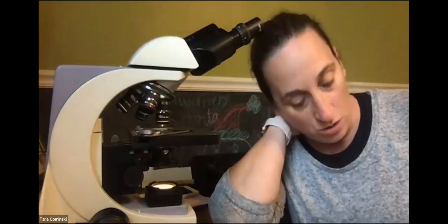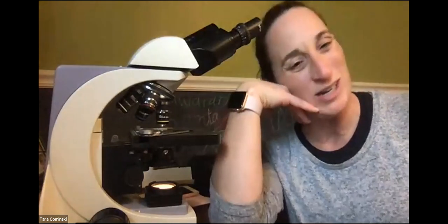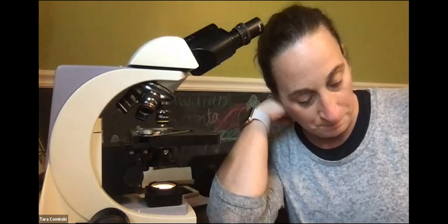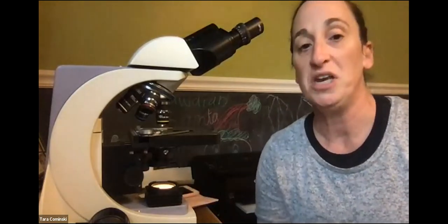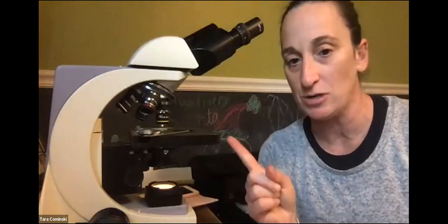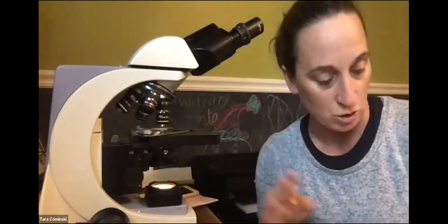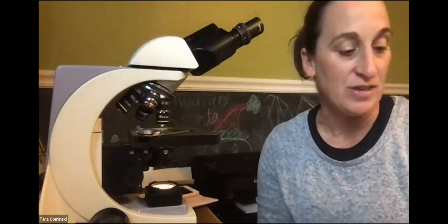And actually that table shows you some differences between the compound light microscope and the electron microscope. You don't need to know those details, just have a basic idea of the differences. Okay, so you should answer those questions there on the bottom of page 16, in terms of, it says which two types of microscopes view the surface of an object, okay? Meaning we're talking about between the compound light microscope, the dissecting microscope, the scanning electron microscope, and the transmission electron microscope, okay? All right.